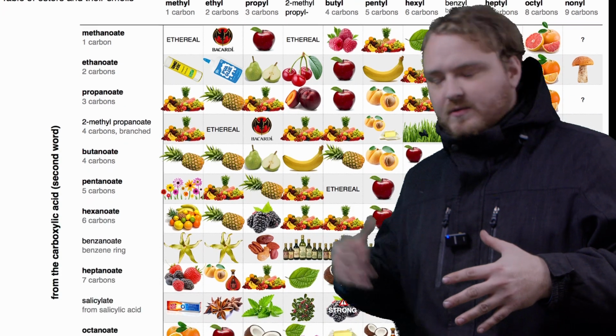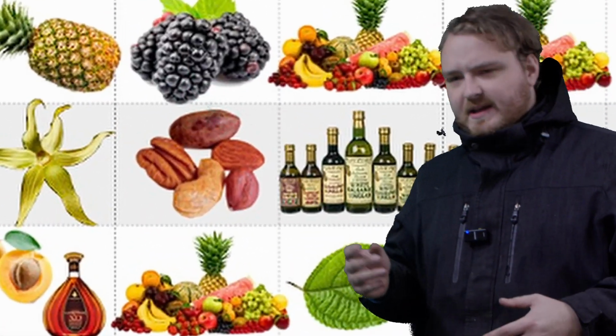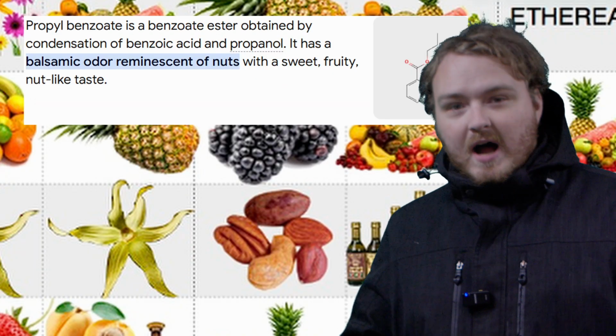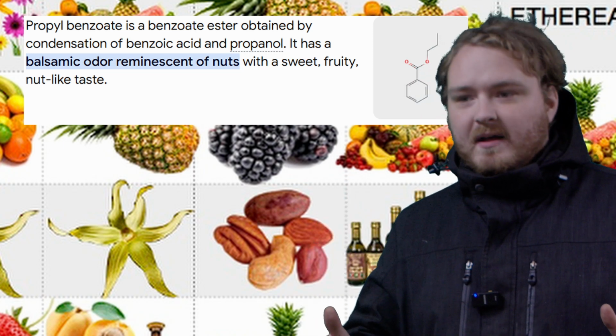So this morning I was browsing through this list of chemicals and their various smells, and I stumbled across something odd. Apparently this chemical is supposed to smell like nut. It seems like a very odd smell, so immediately upon seeing this I'm like, yes, I need to smell that.